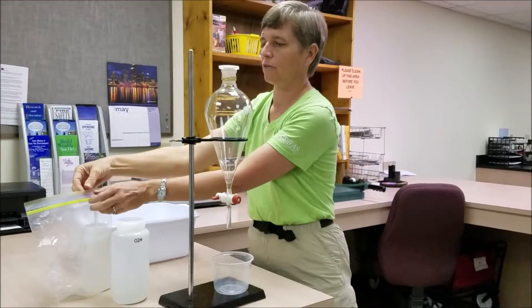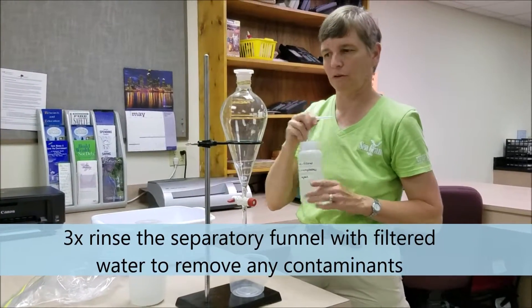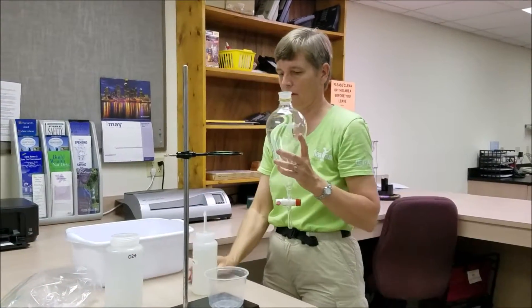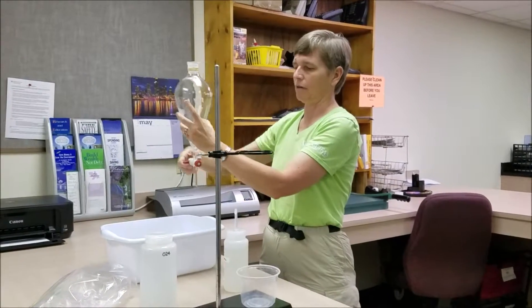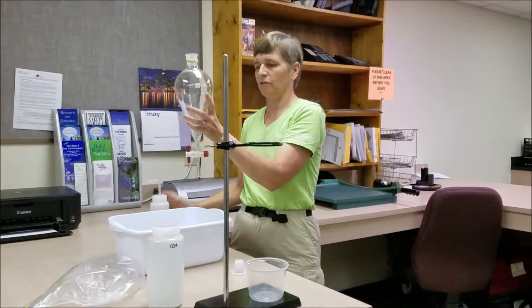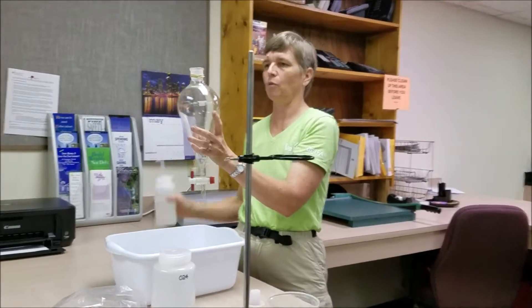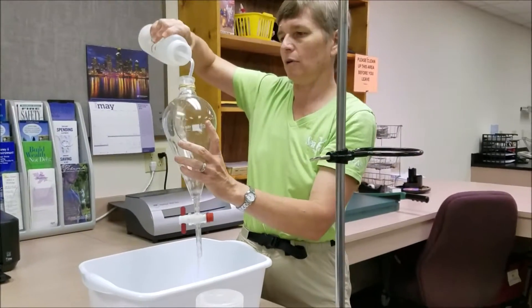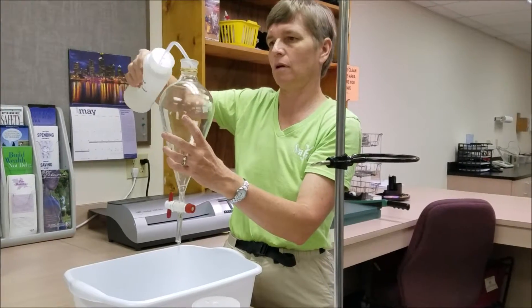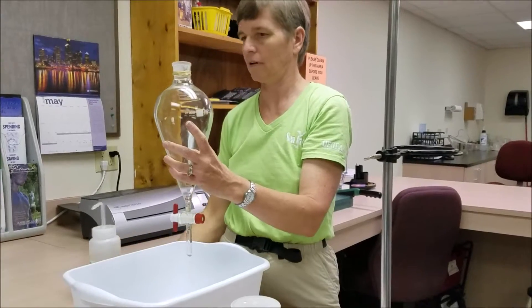As with everything else in this project, we're going to need to triple rinse our separatory funnel with our filtered water. The easiest way to do that is to open the valve at the bottom — when the handle is up and down that means the valve is open and water will drain right through it. We're simply going to spray water through and make sure that we completely coat it at least three times.